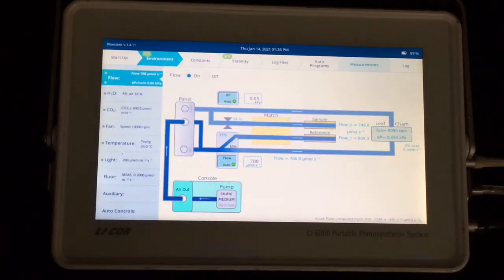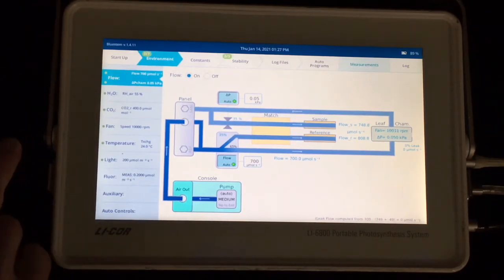Now, if you're working with leaves that have very low assimilation rates or maybe measuring dark respiration, you may want to consider a lower flow rate, which will give you a little bit better signal to noise ratio on that delta CO2. But it will take a few seconds longer to flush. And that's going to be a constant trade-off with a lot of our environmental controls that we'll choose.